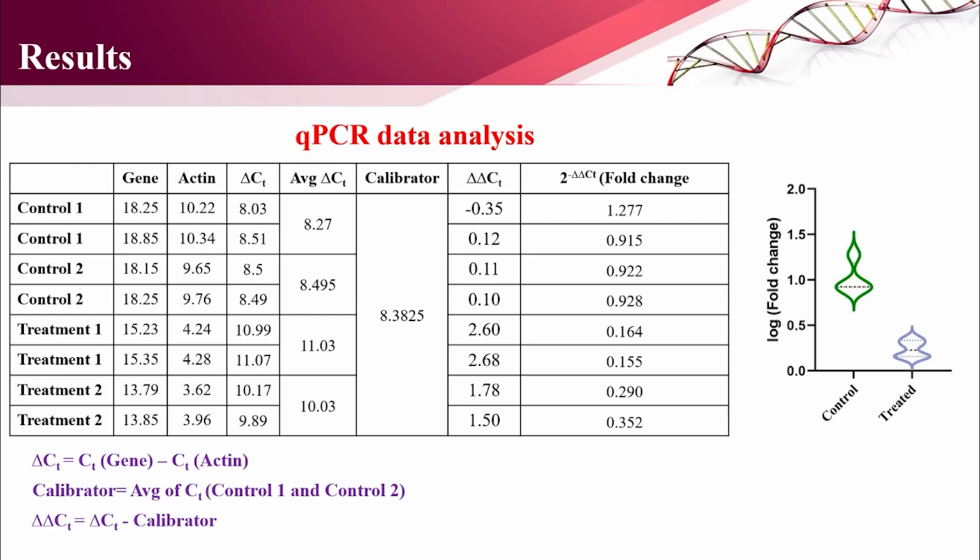So this indicates the change in gene expression. This method is essential for researchers, plant breeders, agriculturists, forensic scientists and others, to find the gene expression.